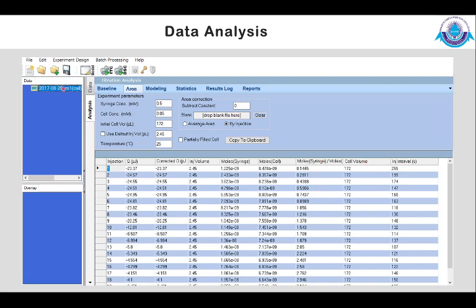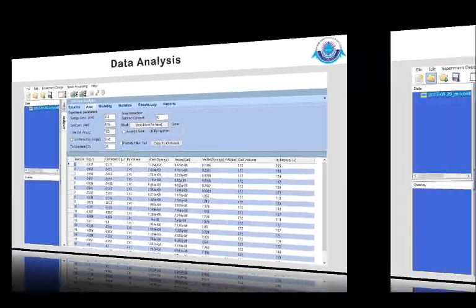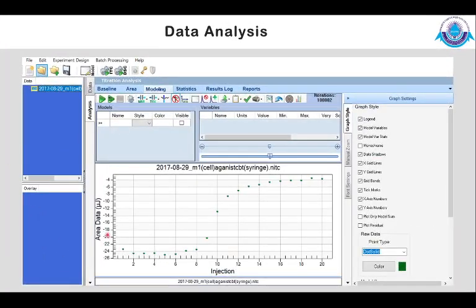Okay, so next, moving on to the next plot, that is molar ratio versus the area under the curve. Okay, so this is what you get. Obviously, as you can see, it looks sigmoidal. There is no issue. We have already got a good starting point.